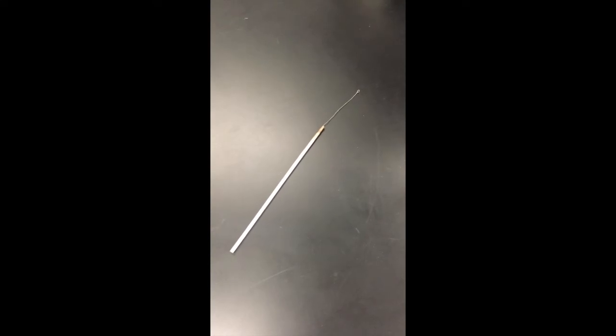Most often, bacteria can be moved from one place to another using an instrument known as a loop. Traditionally, a loop is made of metal with a wire handle and a thin wire ending in a circle.